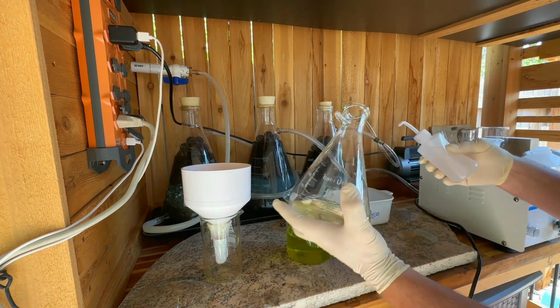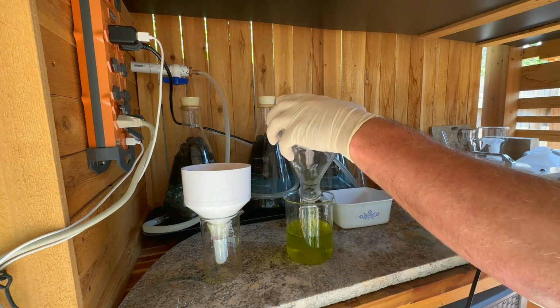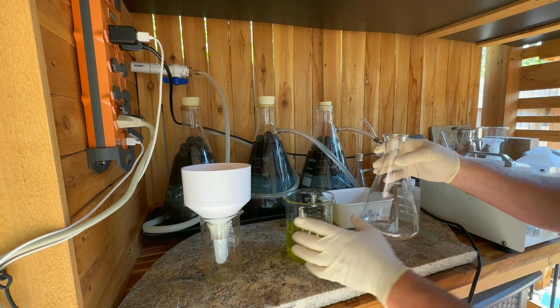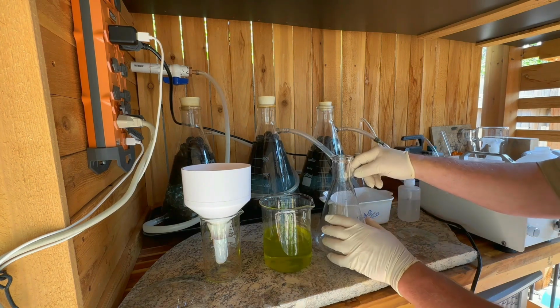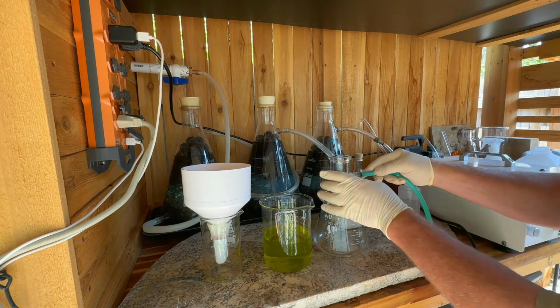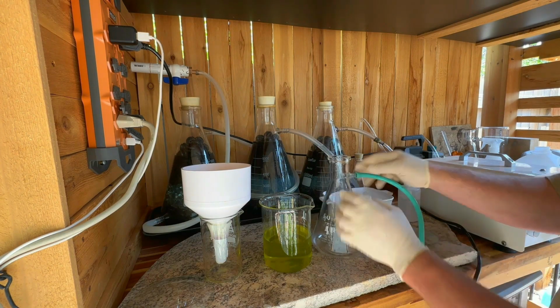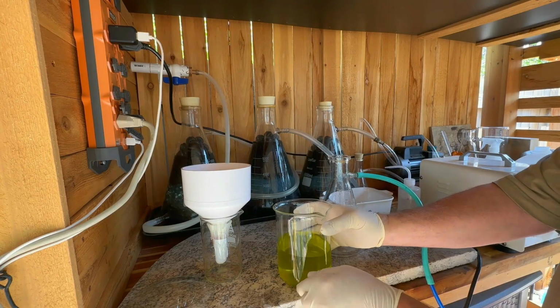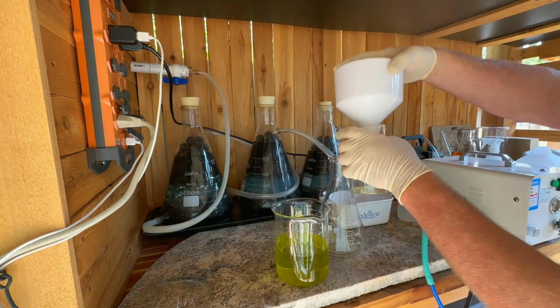It'll be much harder for things to get through. It's going to capture more solids. Hopefully it leaves us with a nice, clean, clear solution. So we'll get that going. Yeah, I'm just going to hold it up. See here, you can see it's got a little bit of fog in there. You can't just see straight through it.